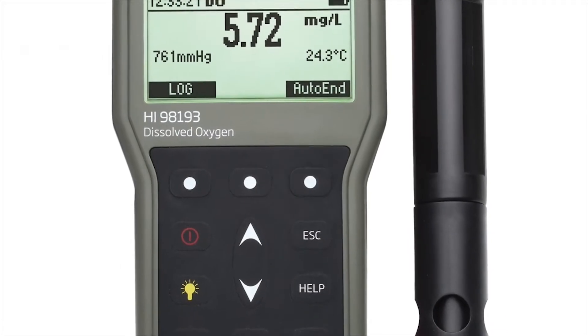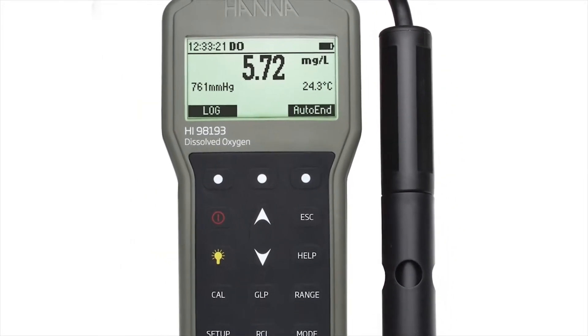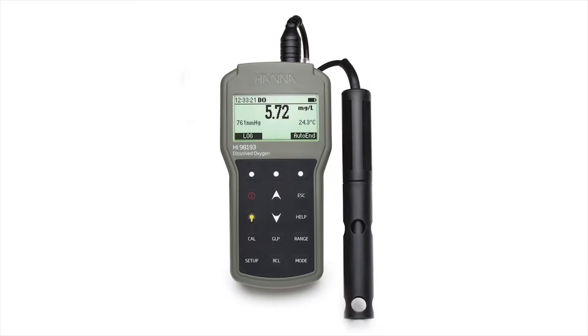The HI-98193 is part of HANA Instruments' line of portable meters and is used in the measurement of dissolved oxygen, biochemical oxygen demand, oxygen uptake rate, and specific oxygen uptake rate.